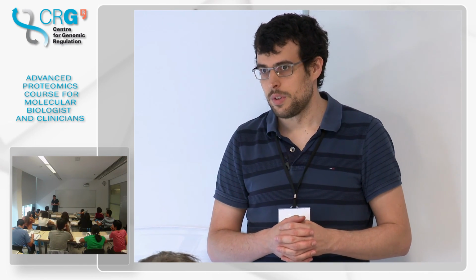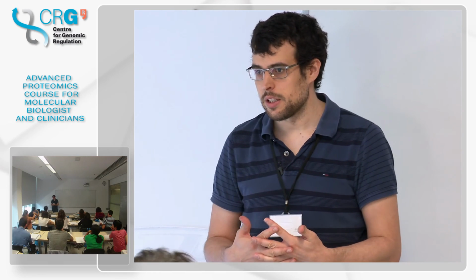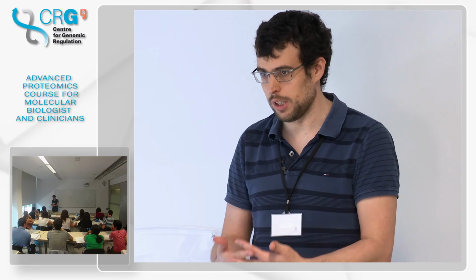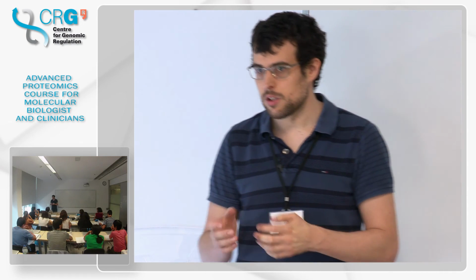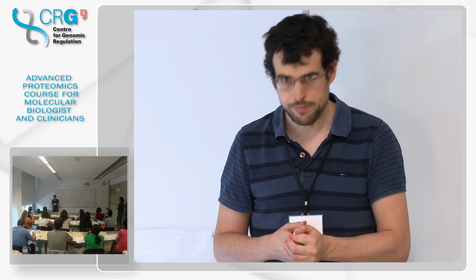With the electron-based fragmentation, yes. With CID, the first one, for many cases with phosphorylated peptides, what happens is that one loses the phosphate moiety. Exactly. So I see the advantage of the electron-based fragmentation. Does the other have another advantage? Yes, for non-phosphorylated samples, it works much better in terms of identification.